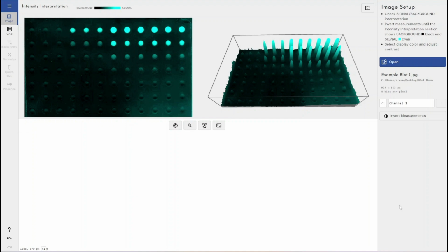It is obviously, like all TotalLab software, equipment agnostic, so if you're using lots of different plate readers or analysis machines, you can bring all of your images into Phoretix Array. It will accept them all and work with all those machines and harmonize your workflow within one piece of software rather than working with a fragmented lab system.